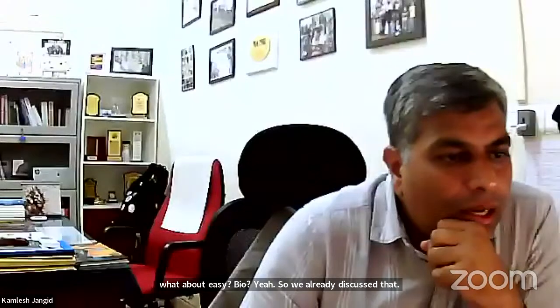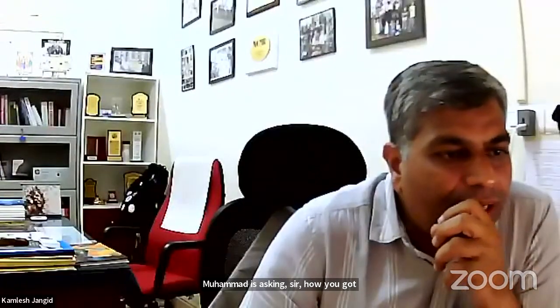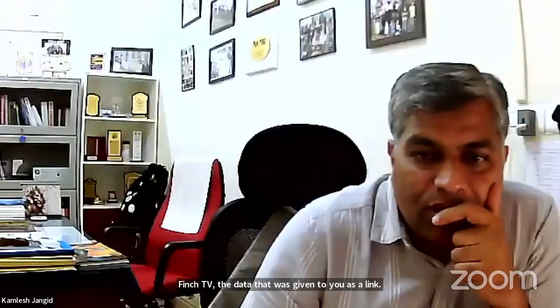Muhammad is asking, sir, how did you get those 4 files that you opened in FinchTV at the beginning? Okay, FinchTV, the data that was given to you as a link in the chat box, the data was downloaded from there. So you can check that.